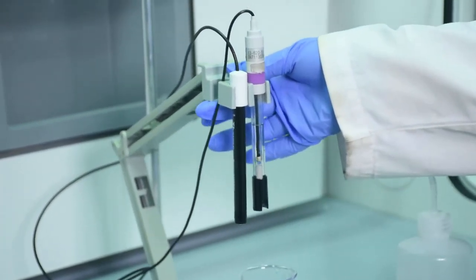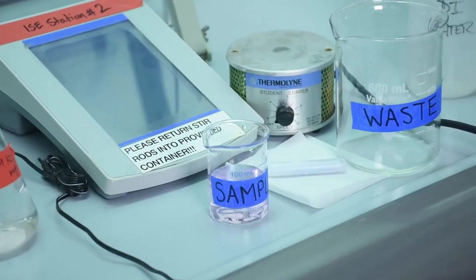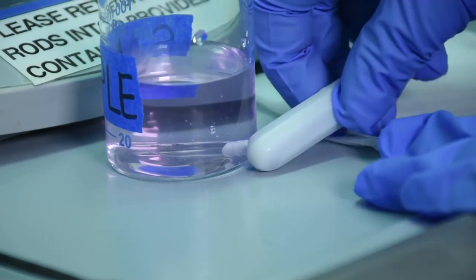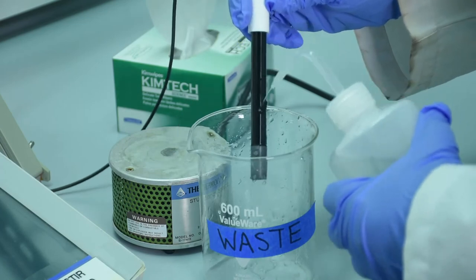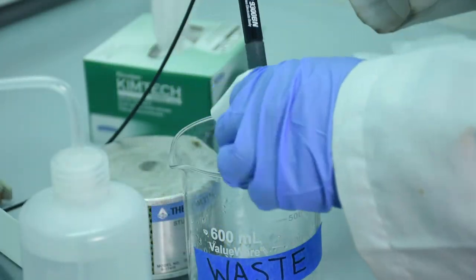Once the potential of the sample has been recorded, remove the stir bar using a magnetic wand or a larger stir bar. Rinse the stir bar and the electrodes with deionized water, then dry the electrodes by blotting them as shown previously.